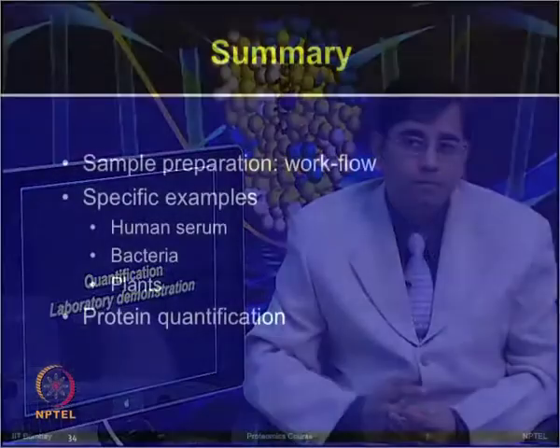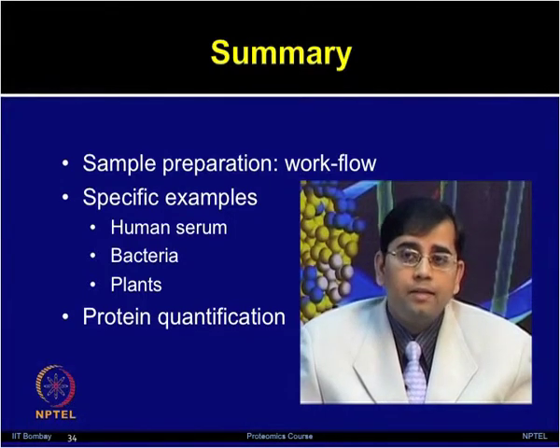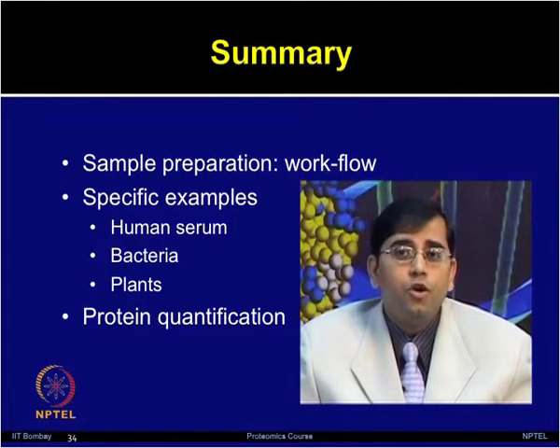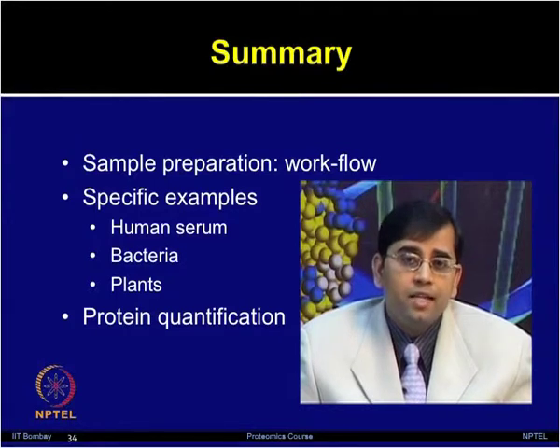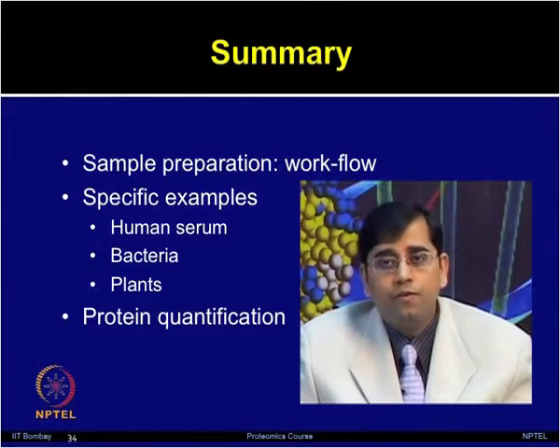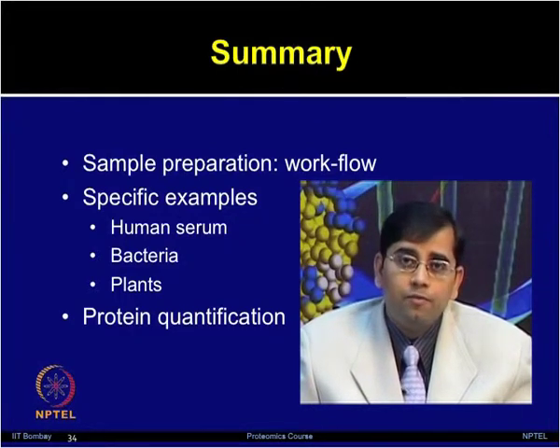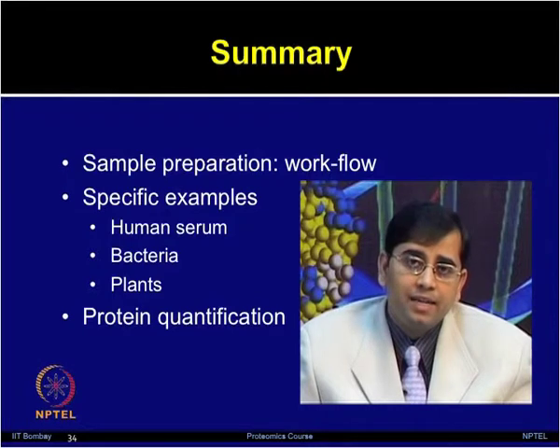Okay, so I hope it was useful for you to watch the video for protein quantification, and you got a feel for how to perform this experiment in the laboratory. So, in summary, in the last 3 lectures, we talked about strategies for sample preparation. I gave you a workflow where we talked about different types of lysis methods.